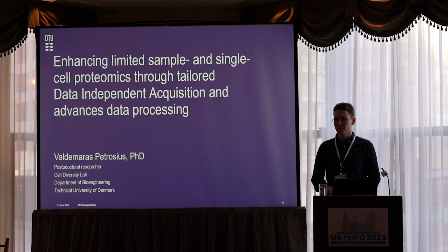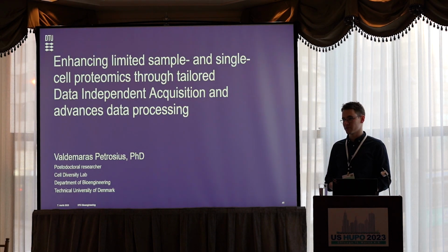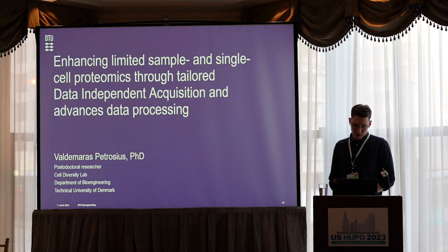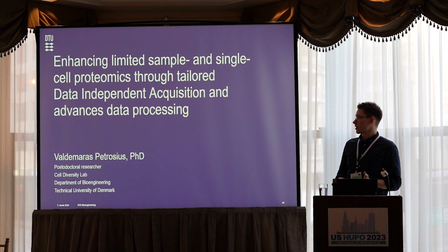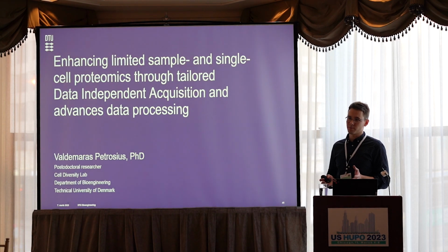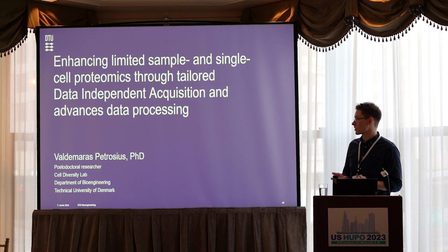So today I'm going to talk a little bit about what we have been working on in Erwin Schoof's Cell Diversity Lab at DTU, which is located in Denmark. The overall goal of the project was to tailor DIA methods to different amounts of limited input, and in the end use these methods for single-cell proteomics.